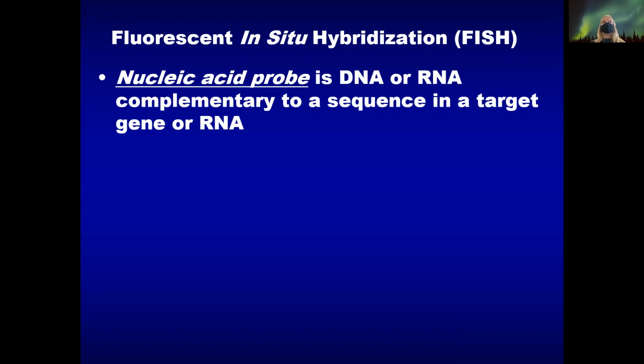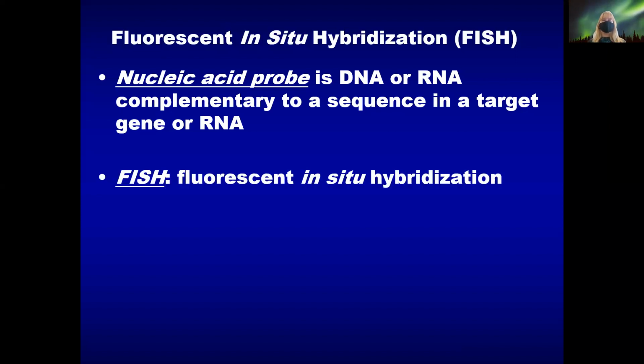So if you're asking whether you have any microbes in this sample that are antibiotic resistant to whatever antibiotic you're curious about, you'd have to understand what the antibiotic resistance gene is. You'd have to know its sequence, and then you'd make a complementary copy of that and tag it. Then you could put that into the system and run the experiment, and the probe would complementarily bind to the DNA of the organism if you run the procedure the right way.